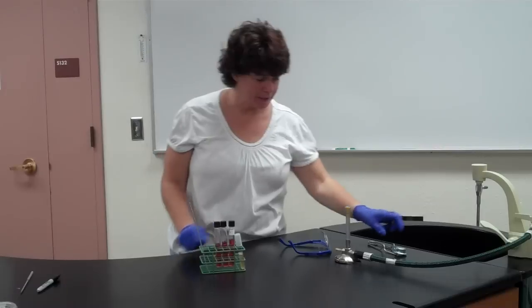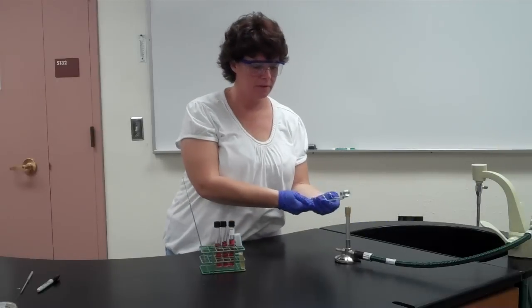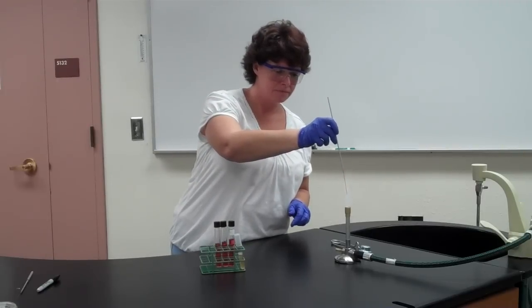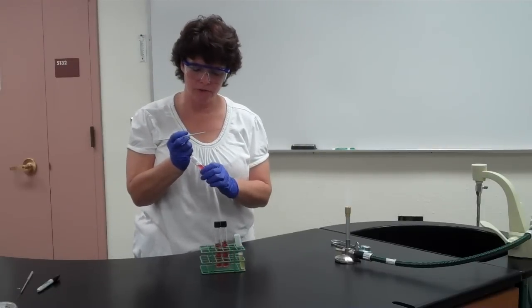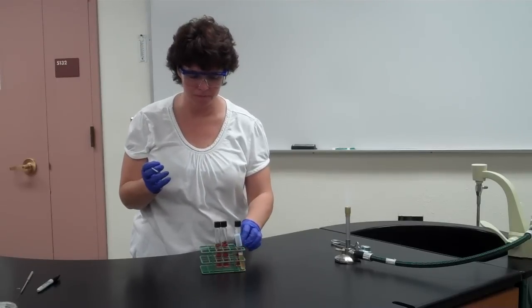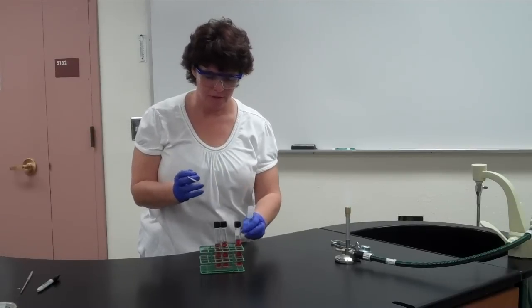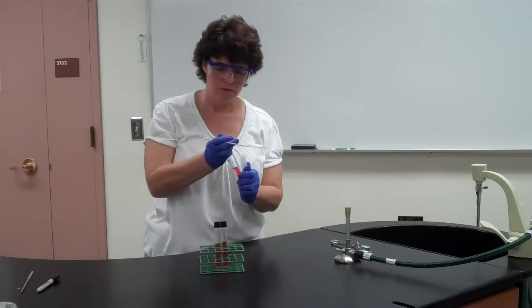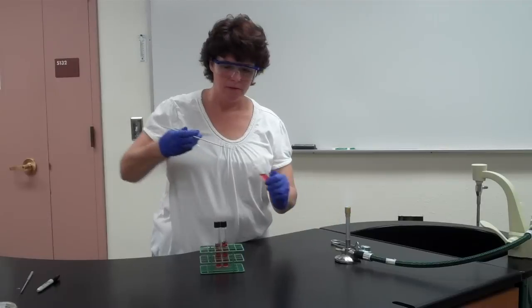So we're going to do what we've always done. Alright. So since it's a liquid, we're going to use a needle. Now these are screw top tubes. So you kind of unscrew it a little bit before you grab the other tube just so that it's not so hard to get off once you have the other tube. Okay? So this may be a little bit more challenging than last time. So I think that I'm going to do it this way and get this one off first with my pinky. And then I'll grab the one for the, so then I'm going to go into it.